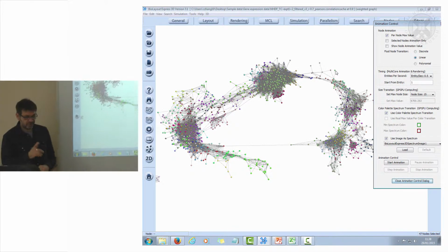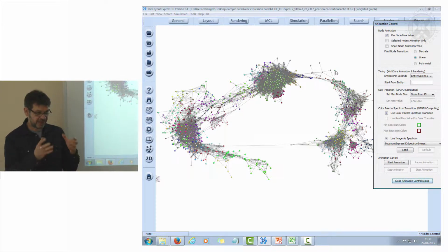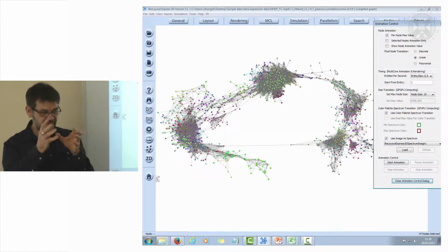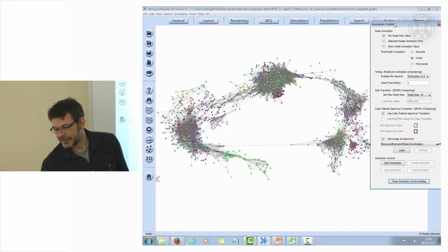I want to now go into the GNF data, show you quite a different graph, a lot more complexity within the graph. But I hope what you've begun to see here is that the graph really represents the numbers and how numbers are related to each other and how different things here pan out.